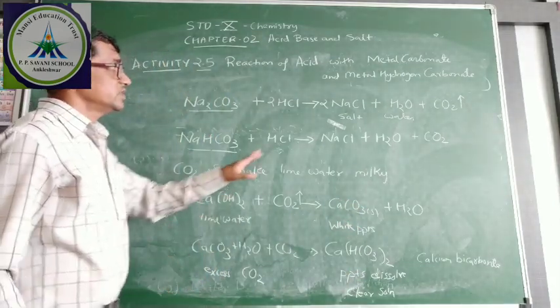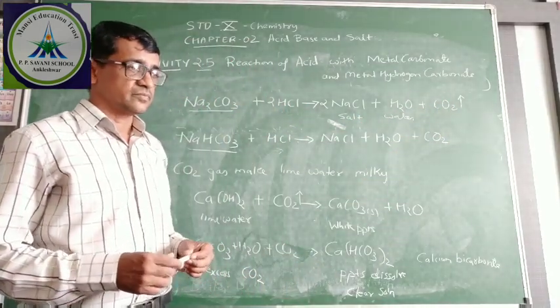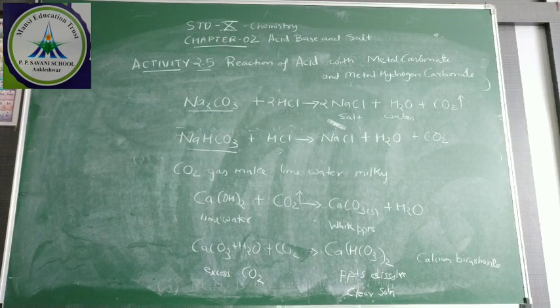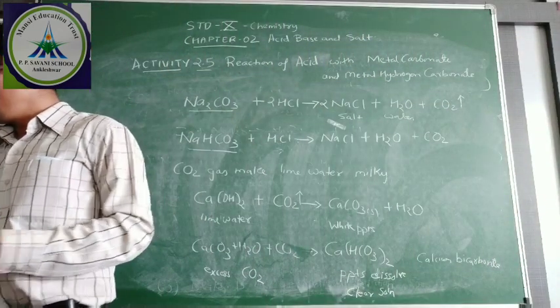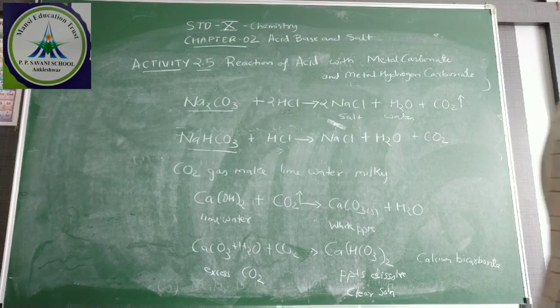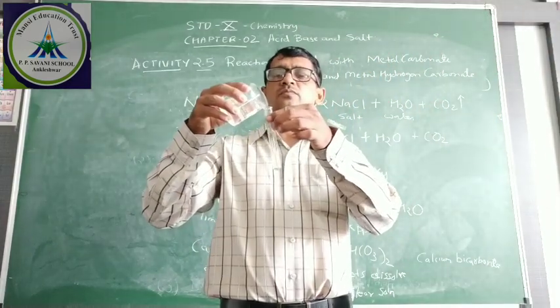Now we will check how this CO2 gas is evolved. One by one we will check by adding acid to sodium carbonate. Okay, in one test tube I am taking sodium carbonate.